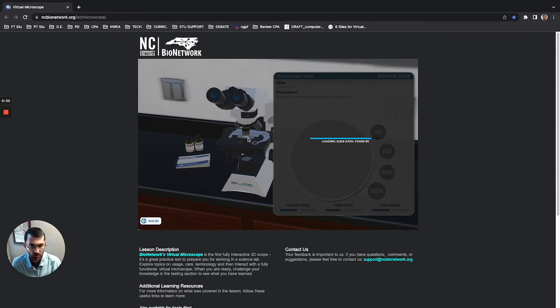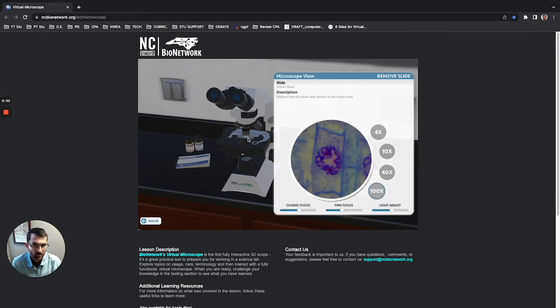So I'll click that. Notice there's a little puddle right there, a little circle that appeared. And we added lens oil. And so now we can really see this cell. And now if you remember, I can't remember if we've gotten to the different stages of the cell, either mitosis or anaphase, prophase. Looks like this cell is going through something, so we can look around at different cells. This looks like a normal cell. It looks like the cell we're looking at is going through something.